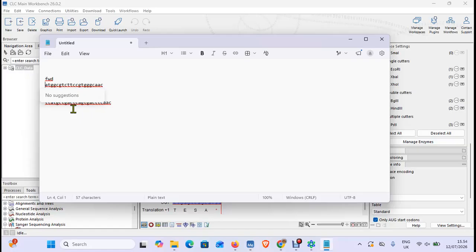So, also, every restriction enzyme has a funny little quirk that it requires at least 2 or 3 bases, in fact 3 is considered the baseline, next to it for DNA cutting to take place. So normally a restriction site in the middle of a whole molecule, that's easy. Just hit that fellow in the middle, no question. But at the end of a PCR product, which is what we're going to make, then we don't want the restriction site being the last thing.